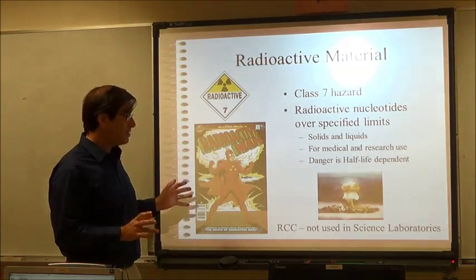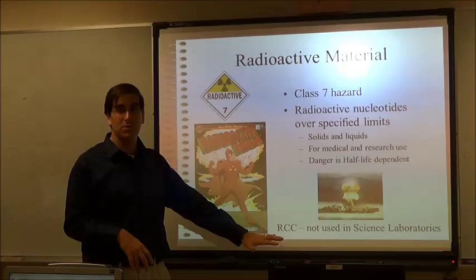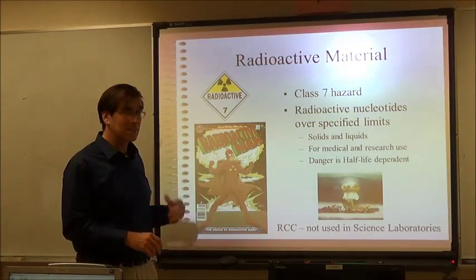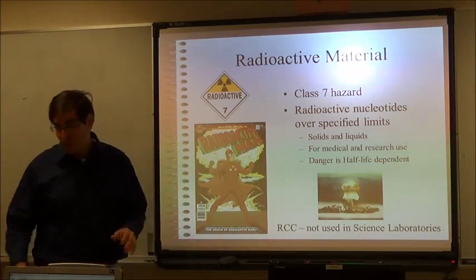Now, that said, RCC does not use any radioactive substances in our science laboratories. And I specify science laboratories because some students here at RCC may have to deal with this later in the nursing program because they use it for diagnostic purposes there. But at least in the science labs, we don't.